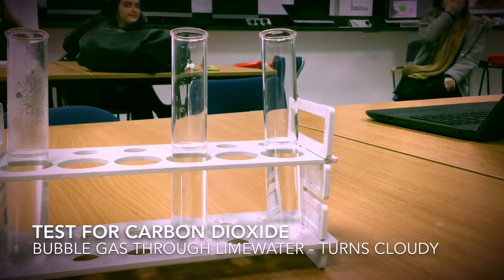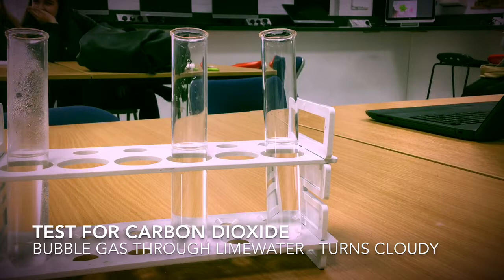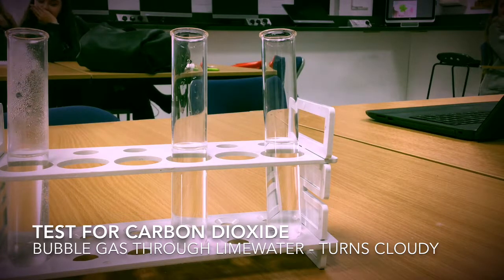I have a test tube of hydrochloric acid, and to this I'm going to add sodium carbonate, which is a metal carbonate. Then I'm going to quickly place a delivery tube over this and bubble the gas through lime water.